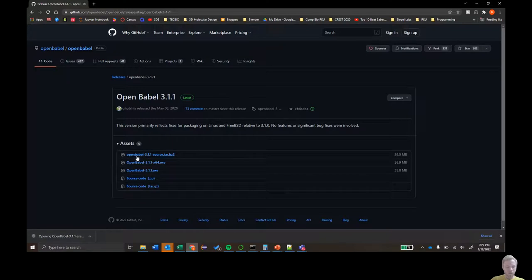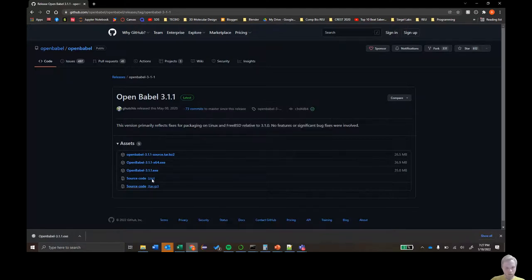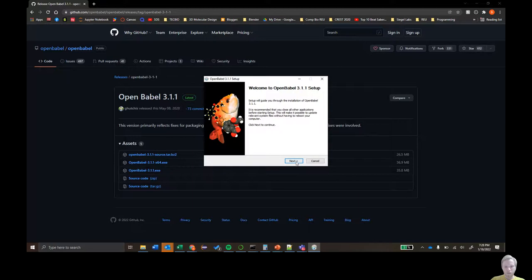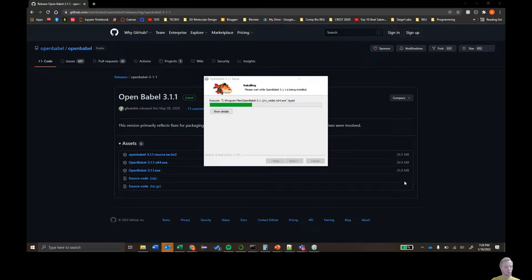Click on the installer, download it and click yes. Just spam next and it should quickly install for you. The purpose of this software is that it allows the translation of one chemical file format to another, which will become useful later on when we do our docking analysis.